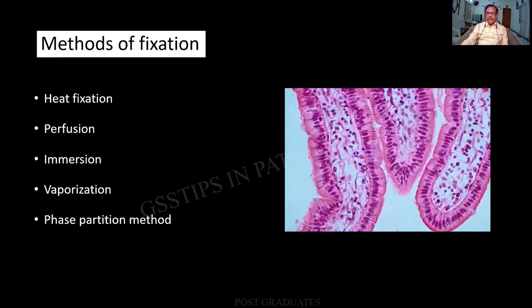Look at the slide over here again. Superb. Though I have taken it from the net, in each and every one of the cells you can see the nuclear cytoplasmic differentiation, the basement membrane, and the cellular components.